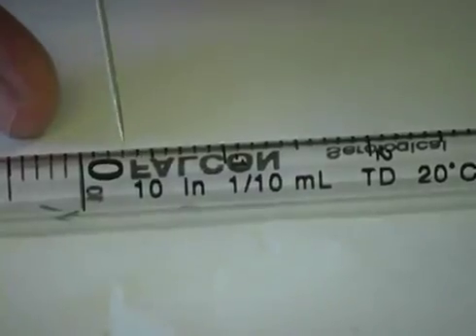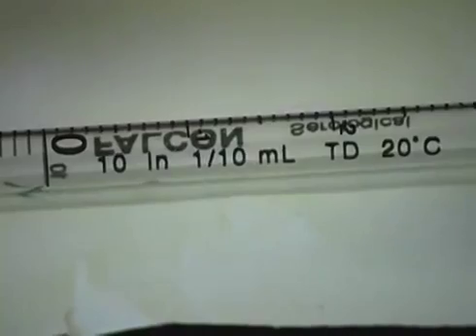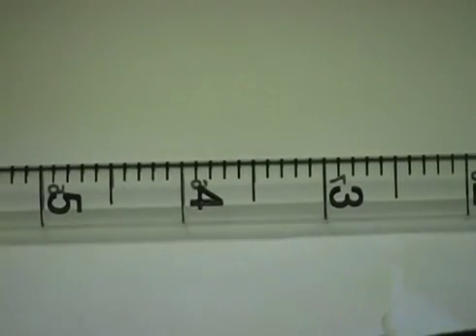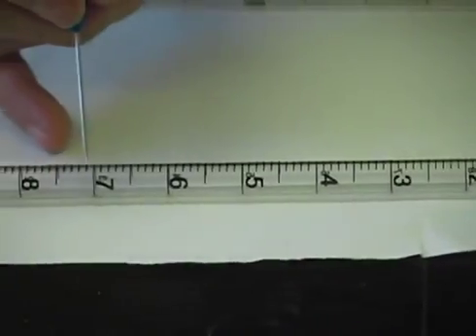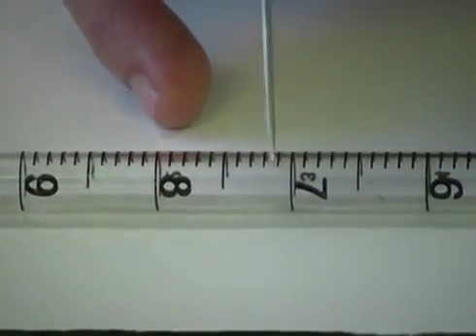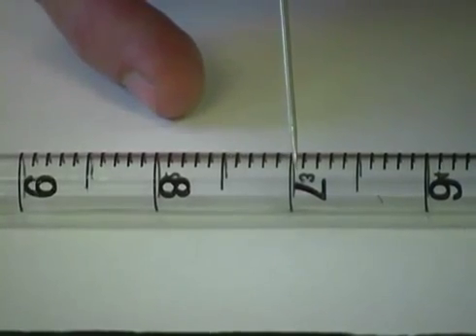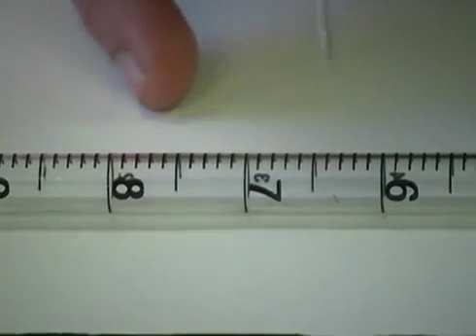On this 10 ml pipette, we see the values 10 and 1/10 ml. This tells us the total volume of the pipette is 10 mL, and the value of the smallest units is 1/10 ml. On the pipette, the major gradations have numbers. The volume between the major gradation lines, in this case on the 10 ml pipette, represents 1 ml. The volume of the minor gradations here is 1/10 ml.